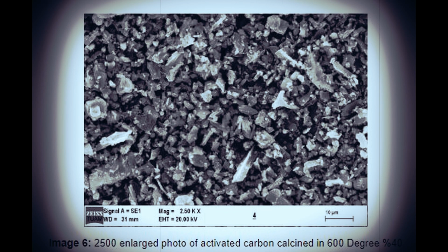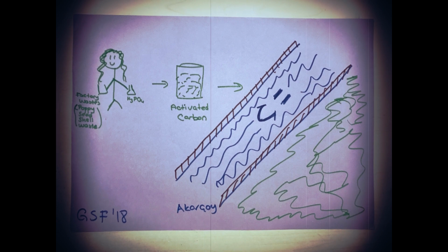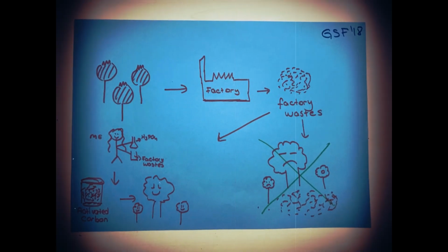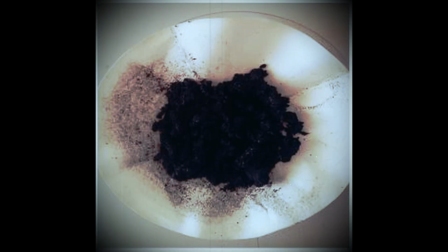I carried out a lot of experiments to measure the surface area of the activated carbons that I produced using phosphoric acid activation and muffle furnace methods. Only 6 of these experiments produced interesting results and showed that the size of a pore was maximum 509.5476. Thanks to activated carbon produced out of waste material, we can stop water contamination and the disturbing smell and view it creates.